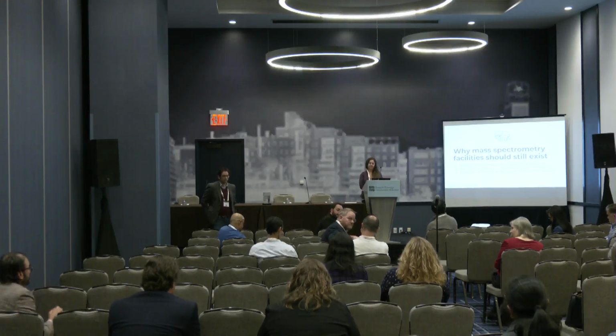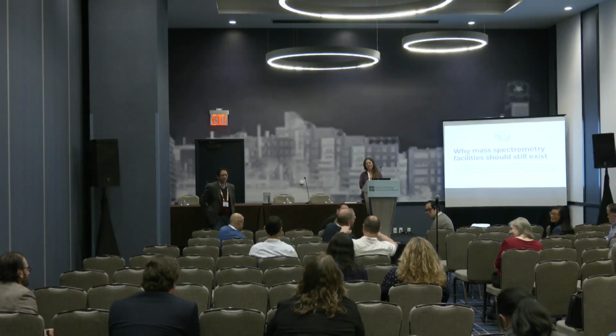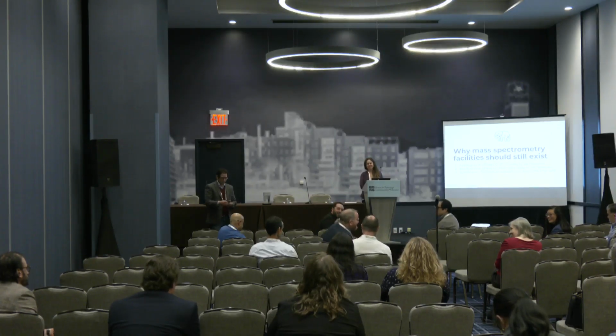What you just mentioned, what you guys both mentioned, made me think what we need is a SomaLogic array of columns. I'm serious. Let it go through, right? Wash it out. Do mass spec. 7,000 samples is annoying, but that would get at the answer.